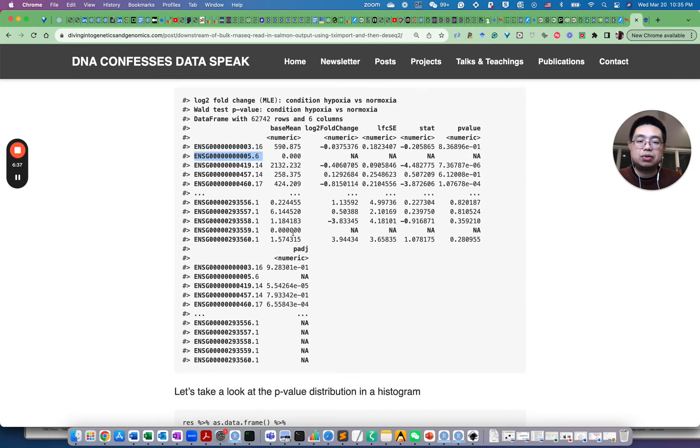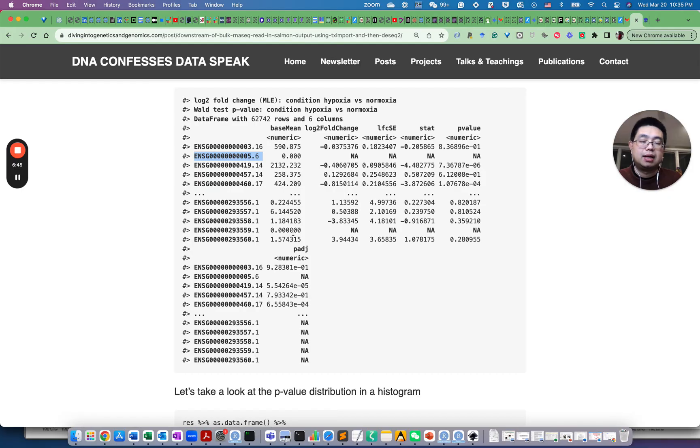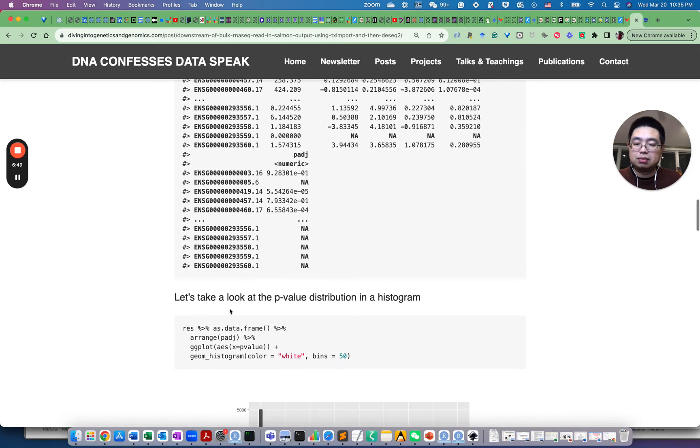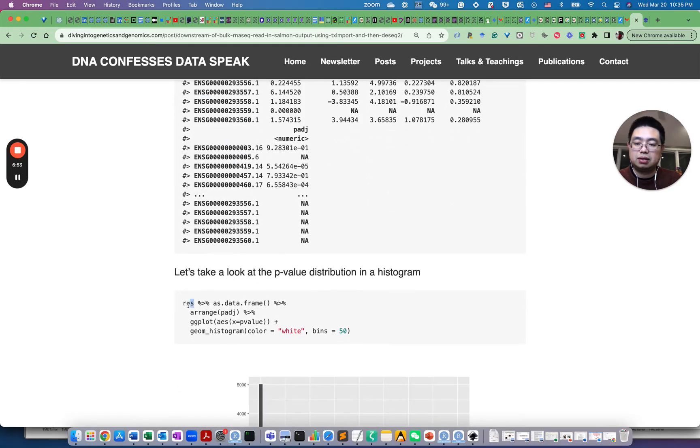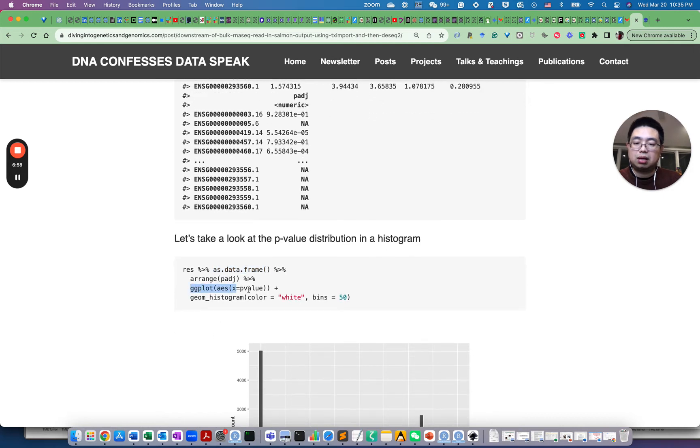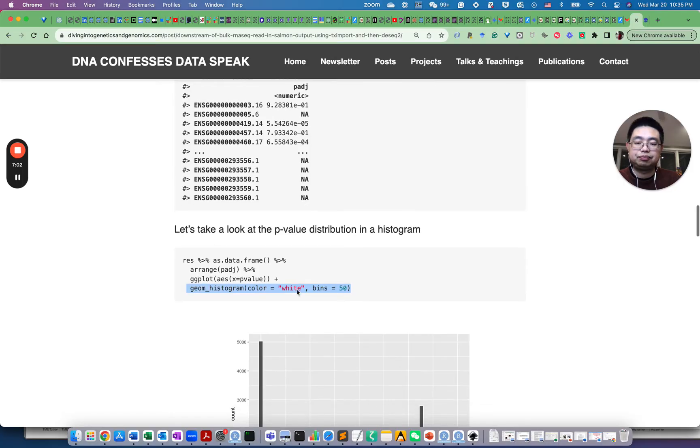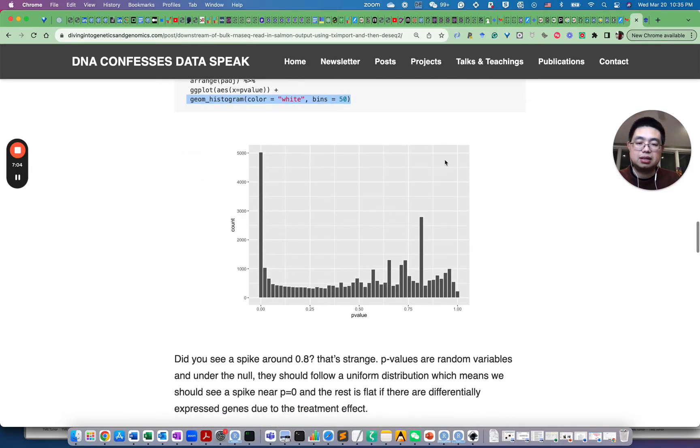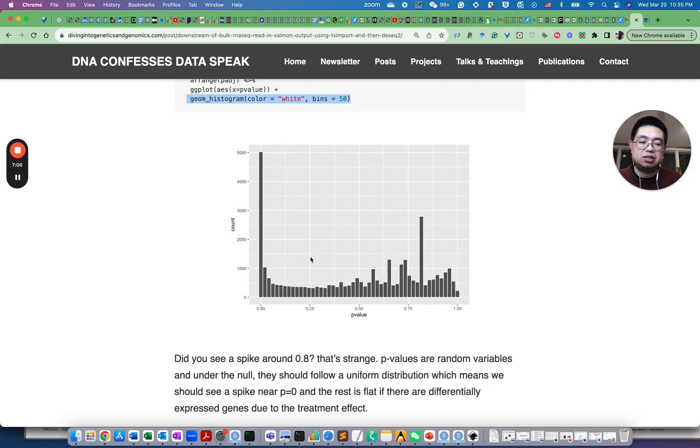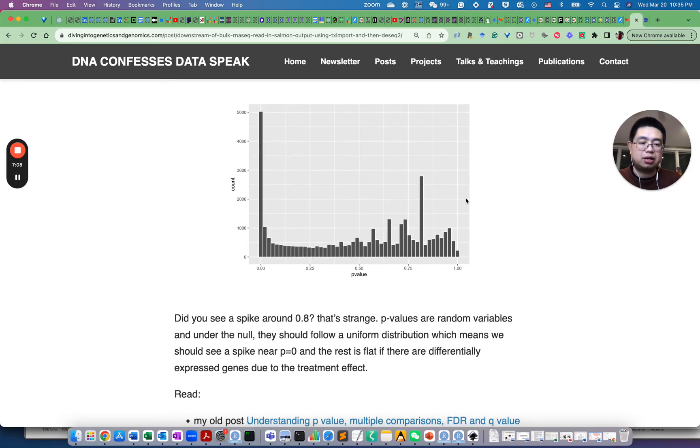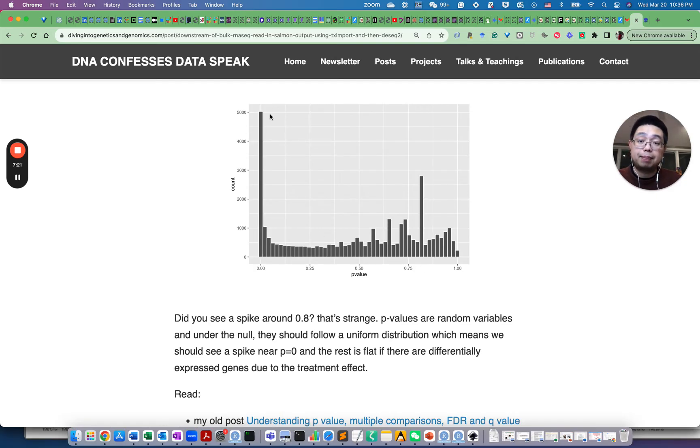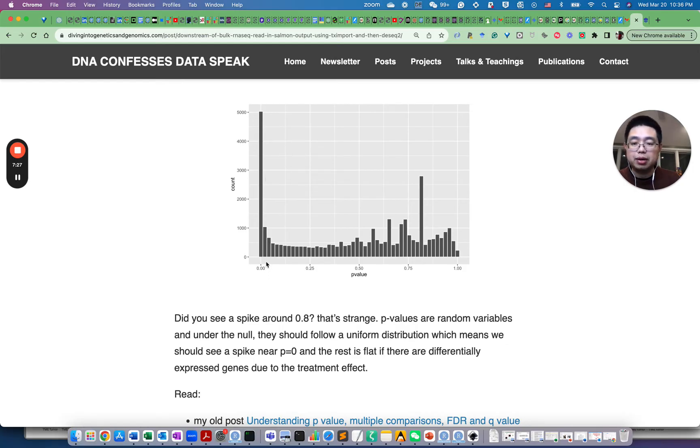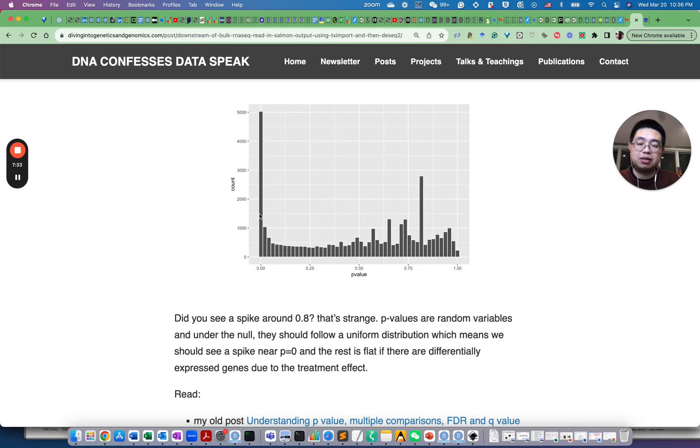But first let's look at the histogram of the p-value distribution. So what we can do, we can convert this results into a data frame and then we can plot the p-value column as a histogram. And you can see here this is the distribution of histogram and then you see some strange thing here, there's spikes here. Those are p-values. Those are really big ones. And you do see a big peak near the p-value equals zero or 0.01. So those are the differentially expressed genes with significant p-values. But this is a little bit strange.